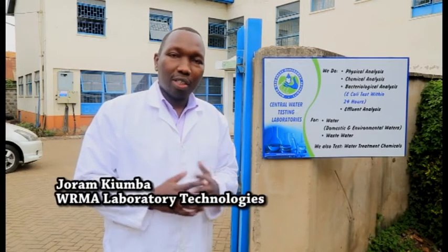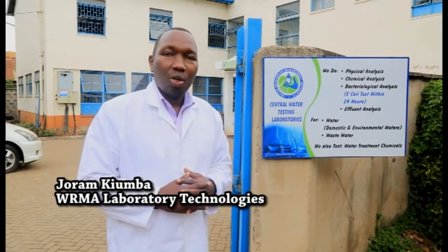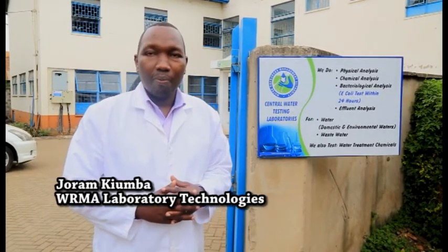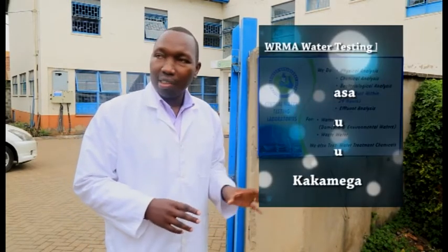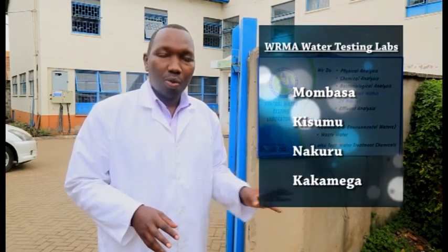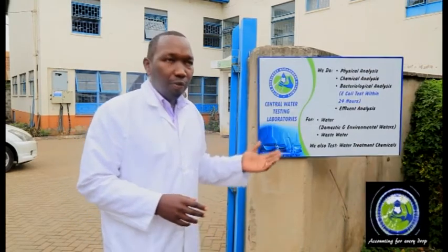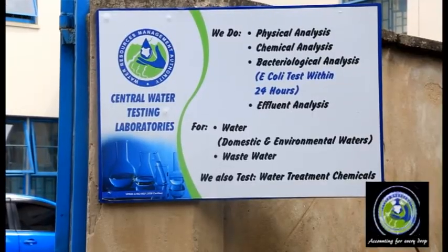Welcome to the Central Water Testing Labs. It is a laboratory under the Water Resources Management Authority, which was established over 20 or 30 years ago. There are 6 laboratories under WRMA in the major regions in Kenya, that is in Mombasa, Kisumu, Nakuru, Kakamega, and we're involved in a few tests.